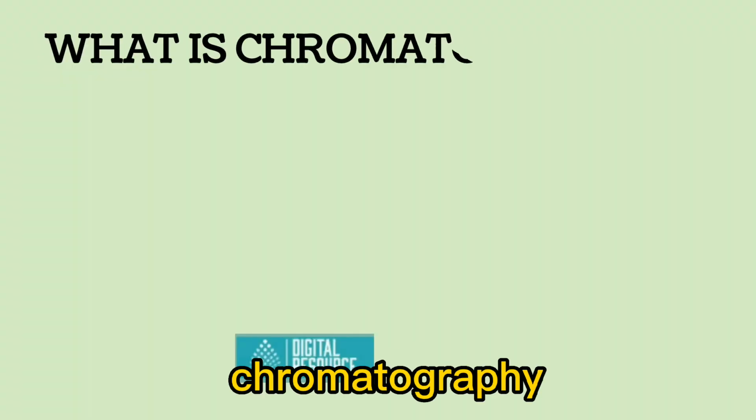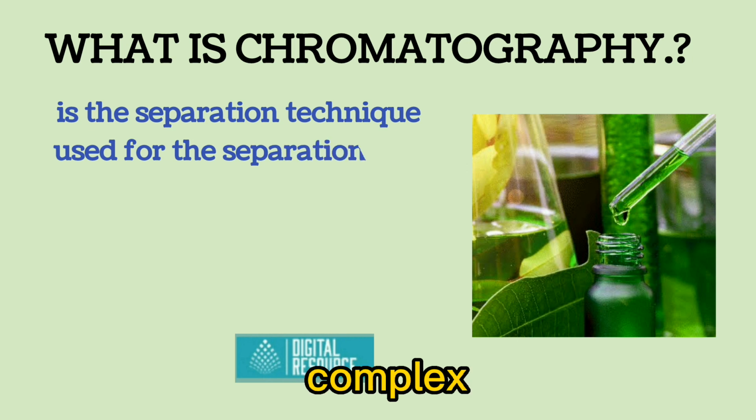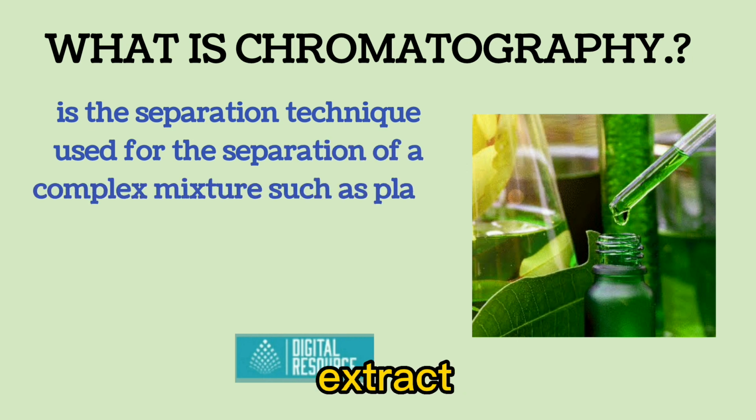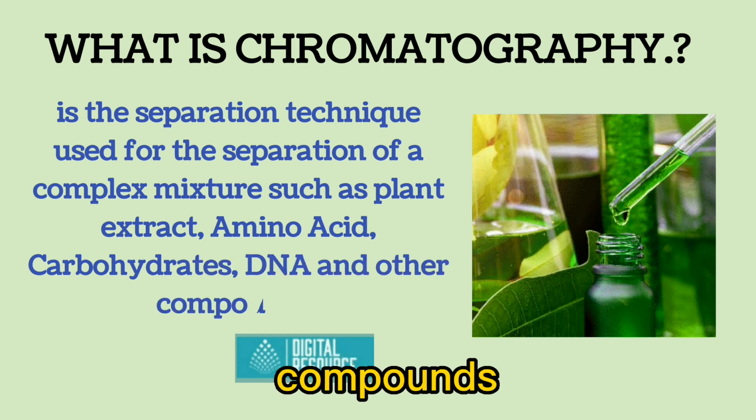What is chromatography? It is a separation technique used for the separation of a complex mixture such as plant extract, amino acid, carbohydrates, DNA and other compounds.